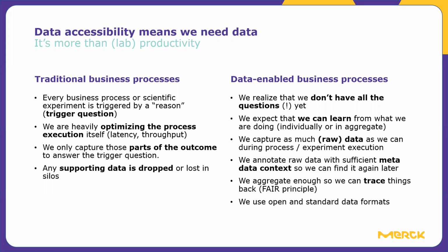We want to capture as much raw data and data as we can during the process or experiment execution. And we want to annotate that raw data with sufficient metadata context so we can find it again later. And that allows us to access the data again at a later point in time.